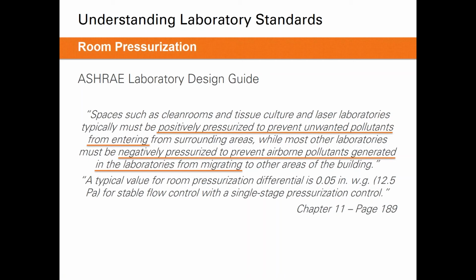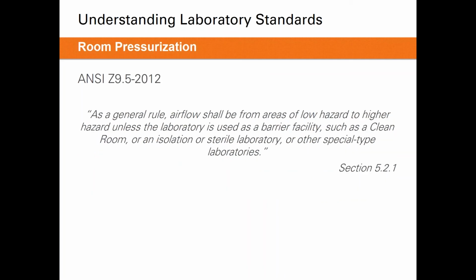Now, a typical value for the room pressure differential is 0.05 inches of water gauge. Whether that's negative or positive just depends on the use of the room, but typically the room pressure differential could be 0.05. Moving on to ANSI Z9.5.